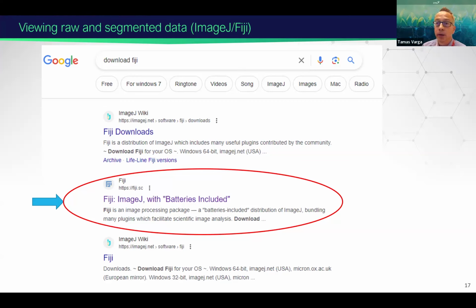For that, I have to note though that just the high resolution data is 30 gigabytes, so it may not be easy to open on a laptop. So we actually use high-end desktop computers in our CT lab that can handle those 20-30 gigabyte data sets. But even though it can be opened in ImageJ, it may not work or may crash on your laptop. So that's the issue of just a large data size from CT.